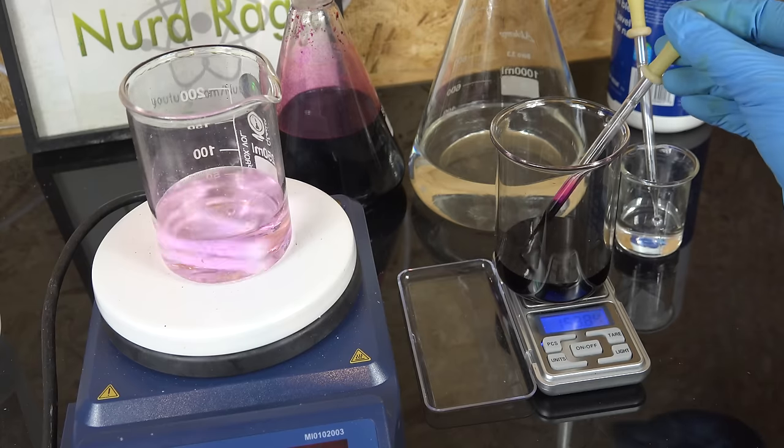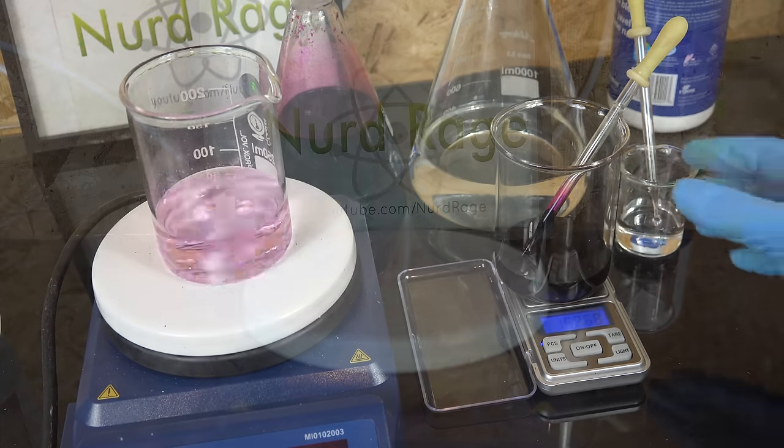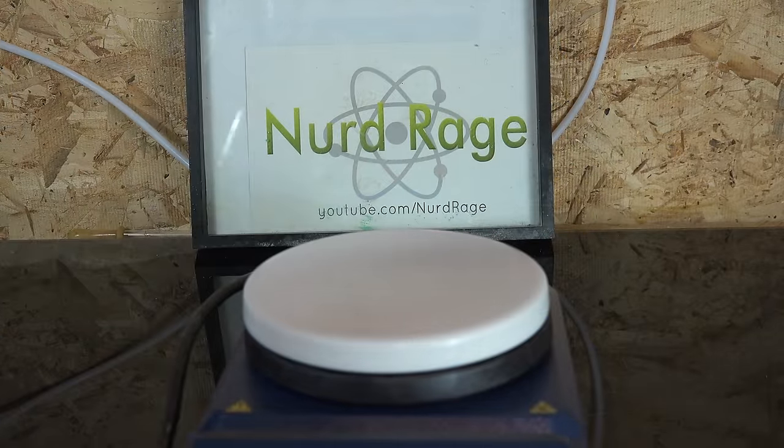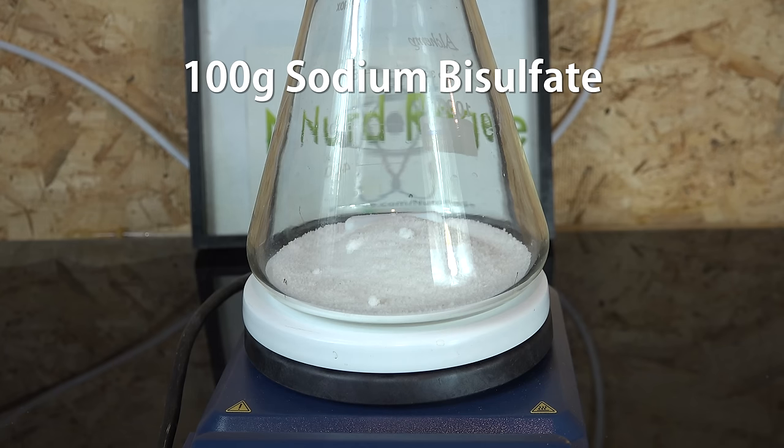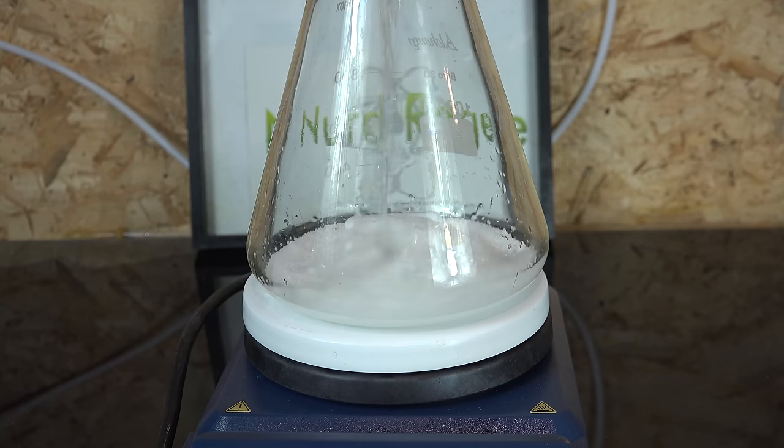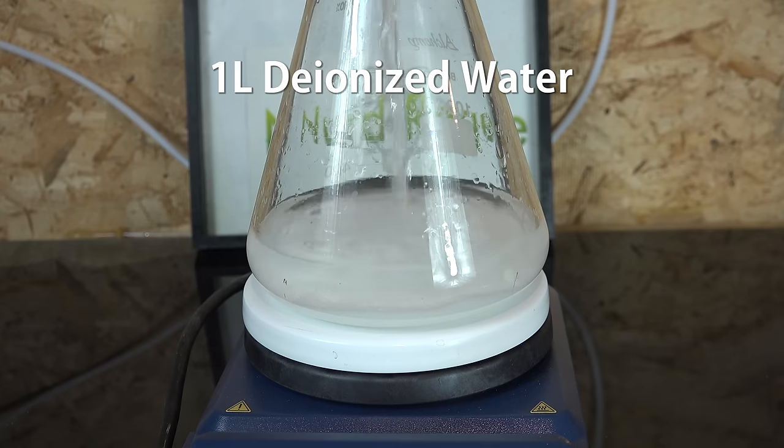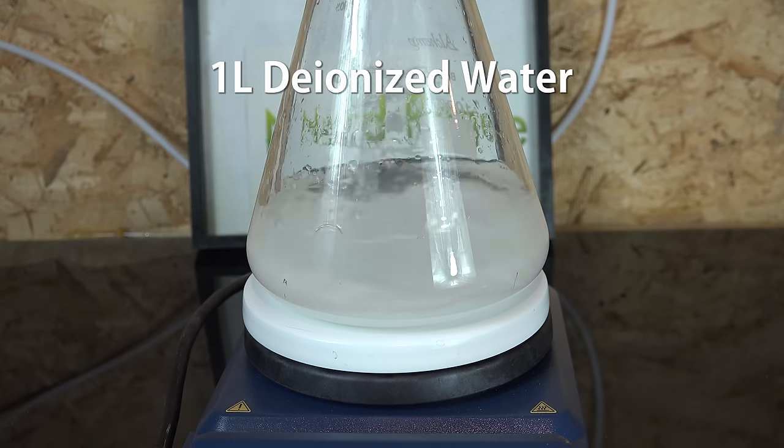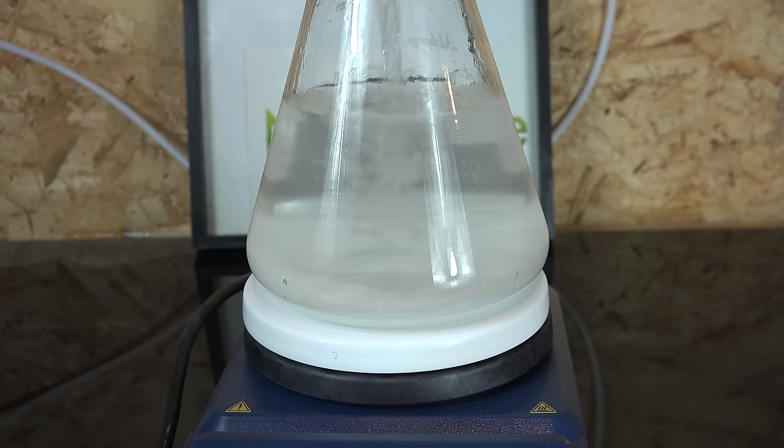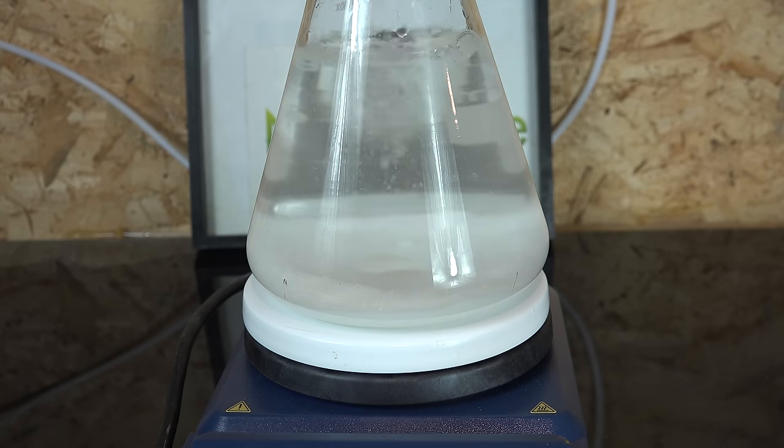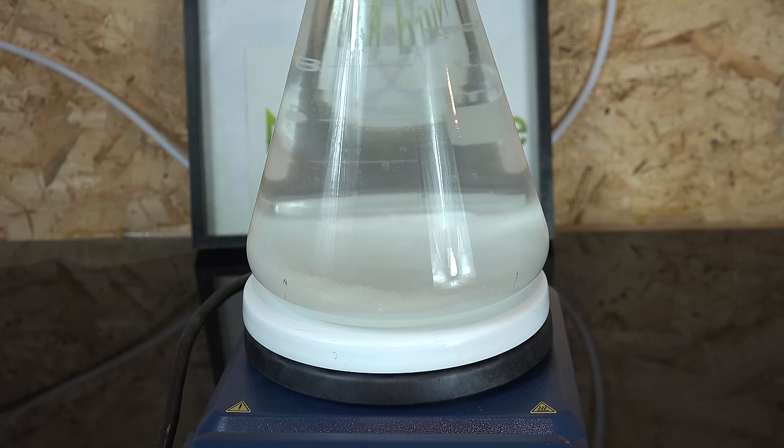So let's make our reagents. First we'll prepare our supporting titration mixture. We weigh out 100g of sodium bisulfate which is a pH lowering chemical for swimming pools, and to this we add 1 liter of deionized water and stir until dissolved. I know it's a lot but we'll need a good stock since we'll be doing multiple trials.